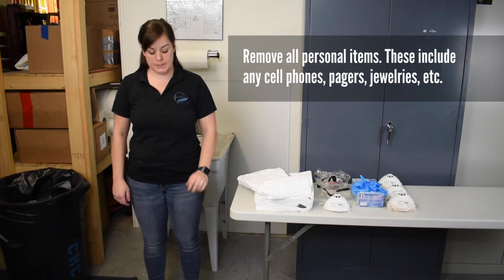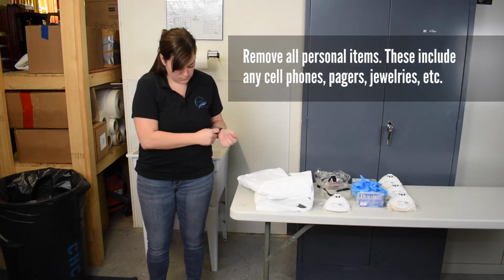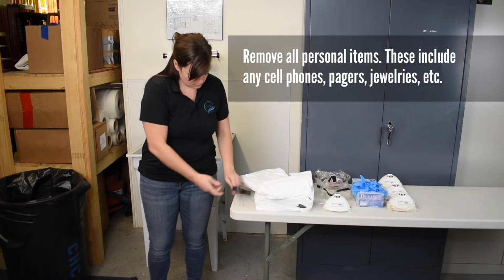First, please remove all personal items. These include any cell phones, pagers, jewelry, etc.